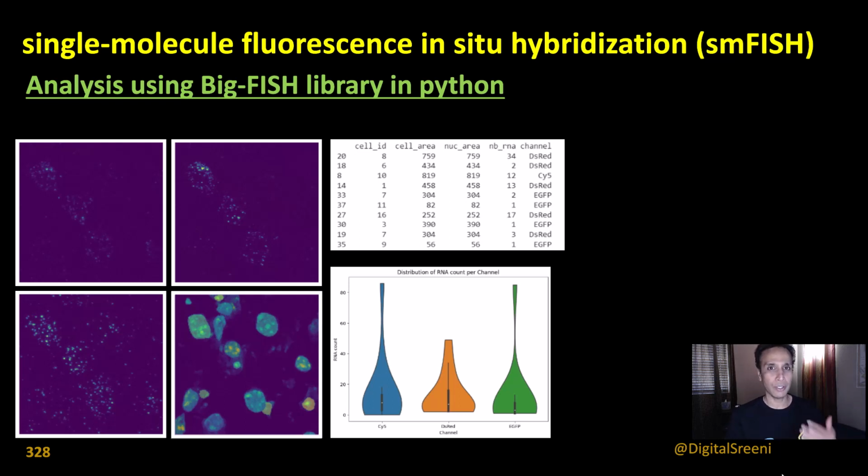This video is a continuation of what we started in the last one, where we got a quick introduction to the smFISH technique. If you haven't watched that, I definitely recommend quickly watching it. It's just a 10-12 minute video, so it's definitely worth your time, especially if you don't know what smFISH is. And if you do know that, then let's jump into this tutorial where we go through the process of analyzing a couple of images from the smFISH experiment.